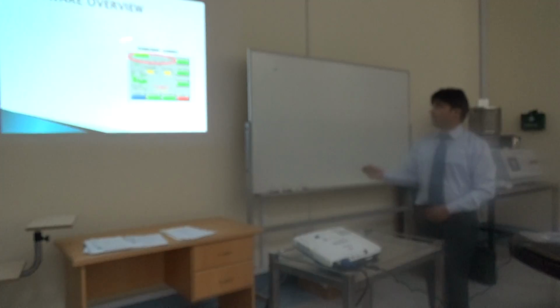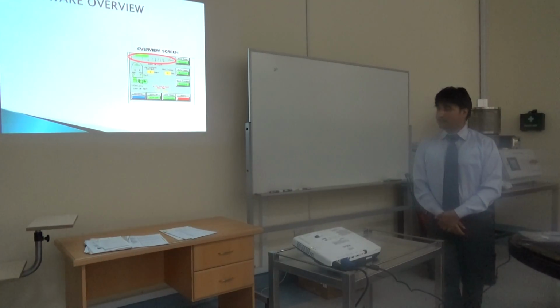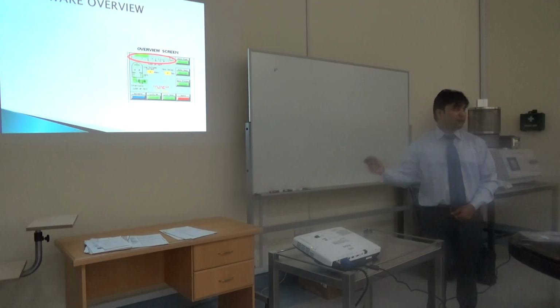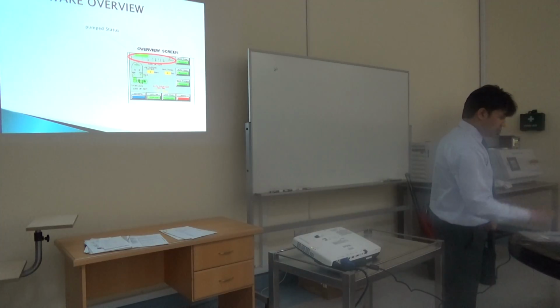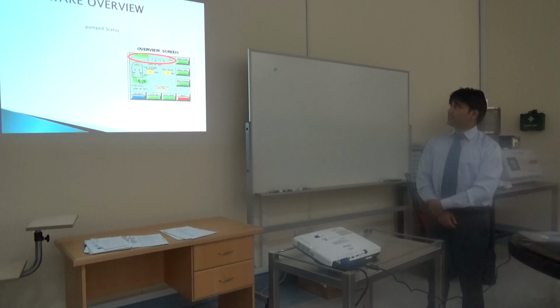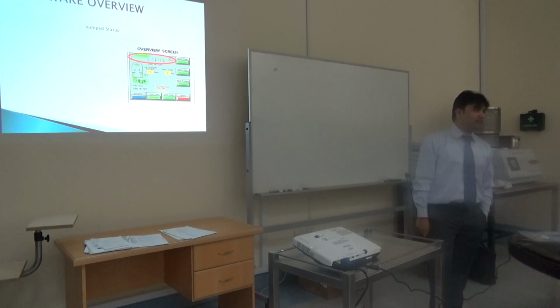When you touch the LCD display, first it will look like that, and here we are going to discuss each and every point about the LCD control. About the first line, on the top of the screen, it will show the pump status, how much pumping we already did inside the closed chamber.